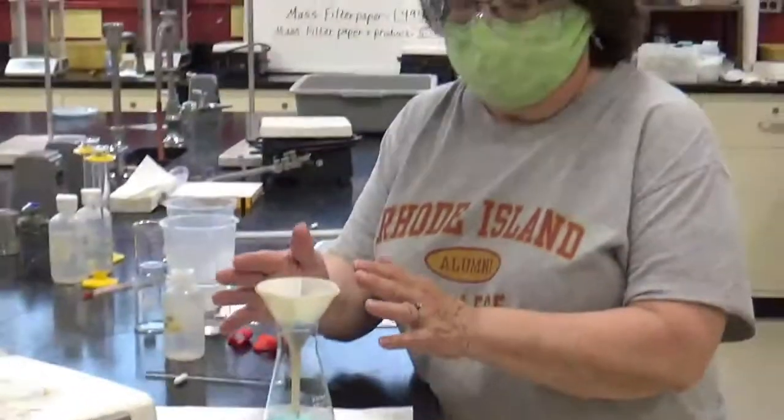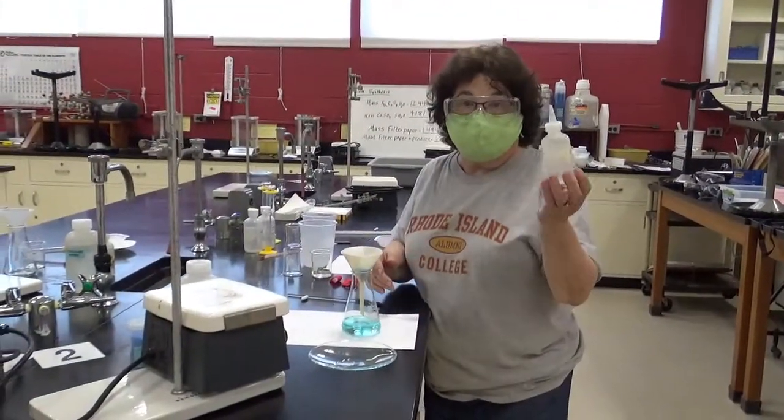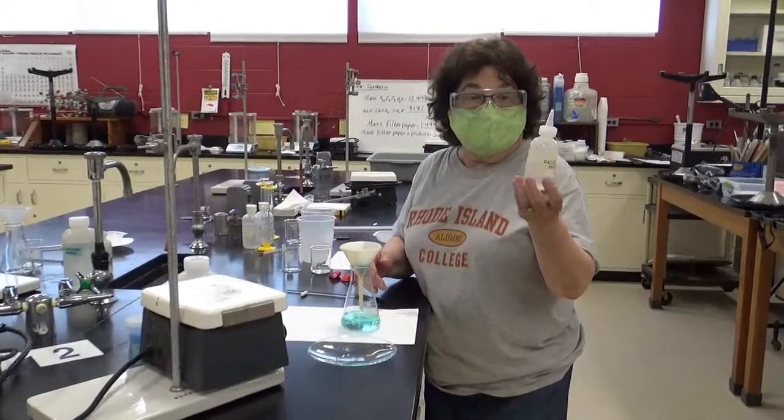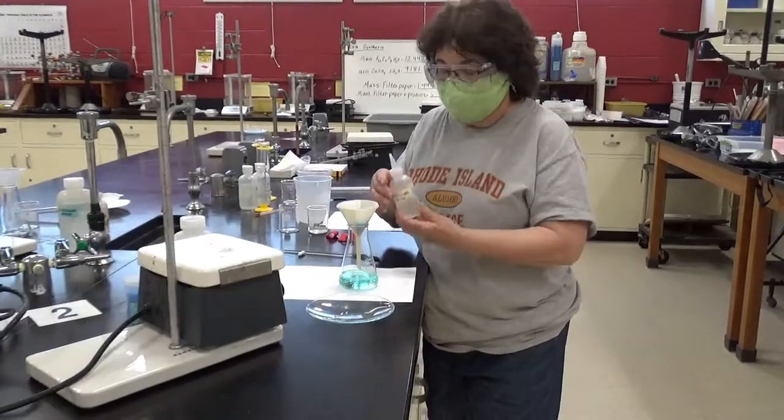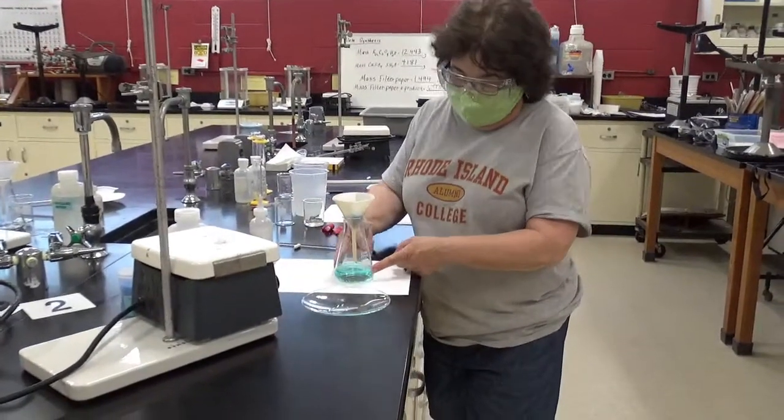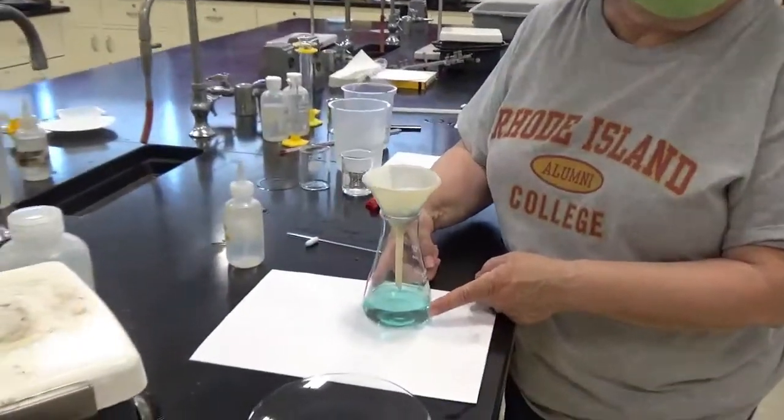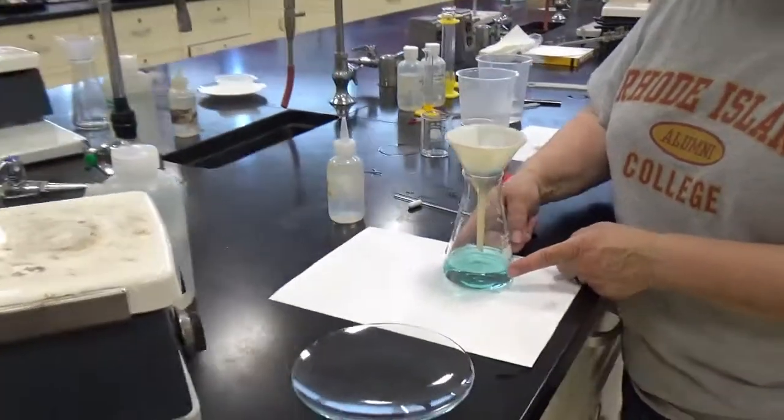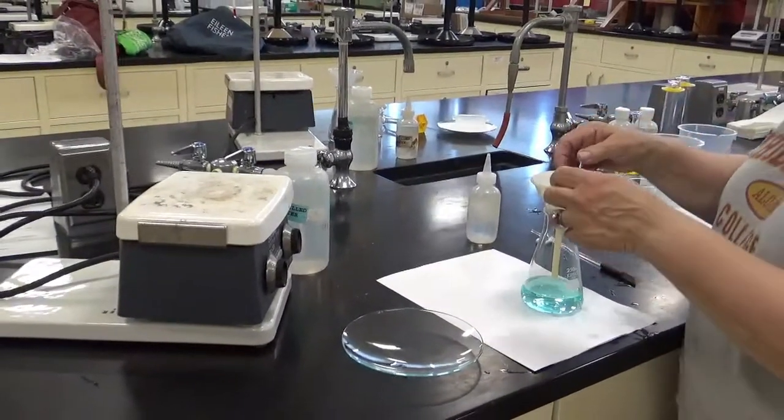Now we've got our filter paper with our product in it. We've rinsed it with some cold, very cold water. Why was it very cold? Why did it have to be cold? You can answer that question. I hope you made observations about the filtrate and what color it is. It started off clear, now it's got that little bluish tinge to it. Why? We'll think about that.